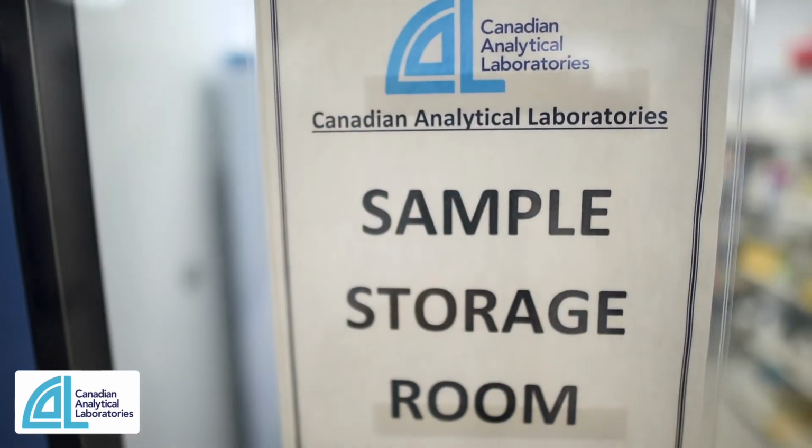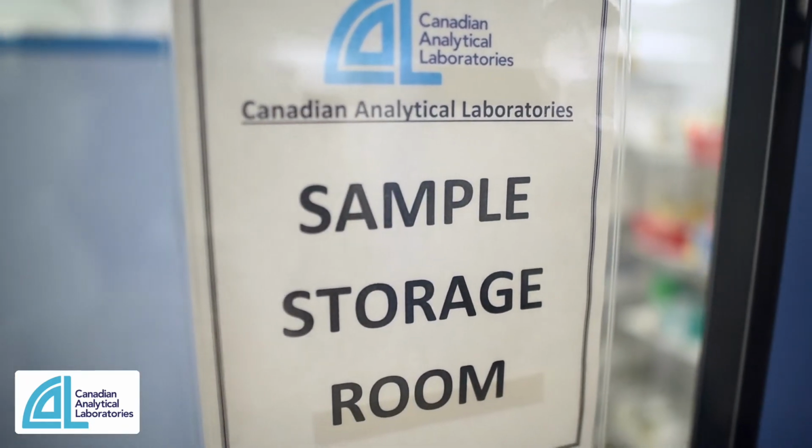So stop 2 on the life of a sample at Cal is the sample storage room. Once it's assigned an analytical report number through LIMS, it makes its way here, and then the samples are distributed based on the tests that have been requested.